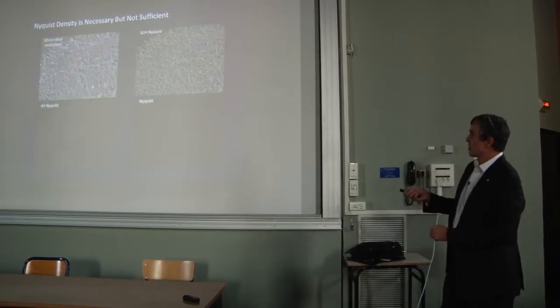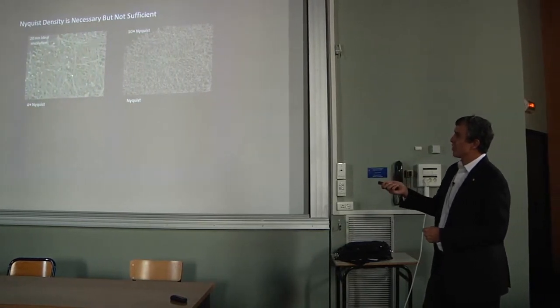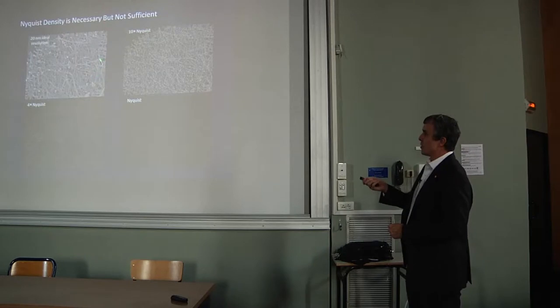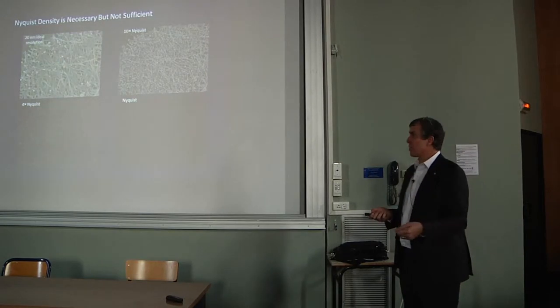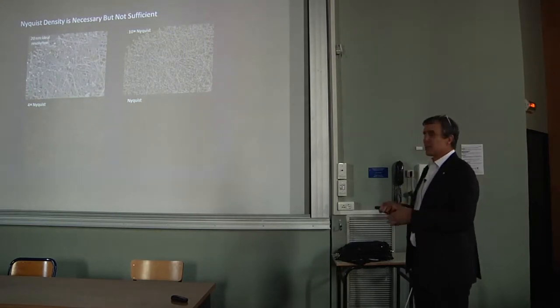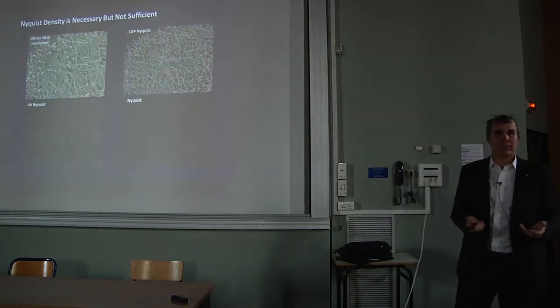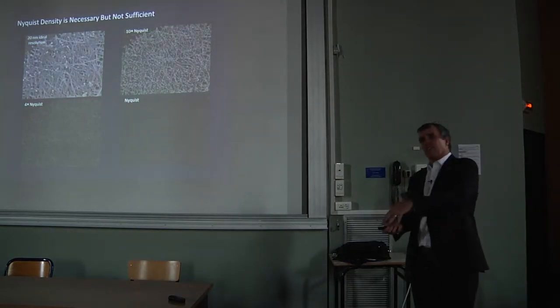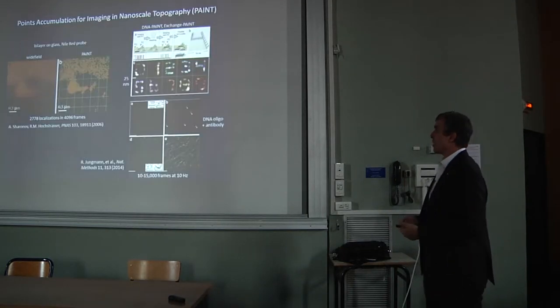So this is almost hopeless to see in this slide, but here's an electron micrograph in which we blurred to about 20 nanometer resolution. If instead we start popping molecules onto the structure in another Gedanken experiment, if we do that at that Nyquist criterion, there's still so much stochasticity in where the labels fall that it's not a good enough criterion. You really have to go almost 10 times beyond the Nyquist criterion of labeling to really decorate the structure with high fidelity. And so that means it's not 500, it's 5,000. And it gets really, really difficult. It's doable, but it's really difficult to do that.